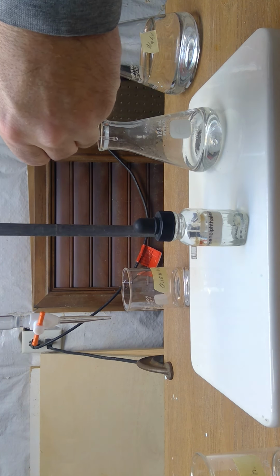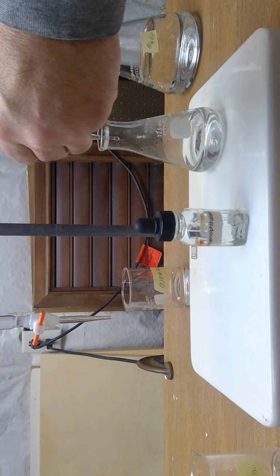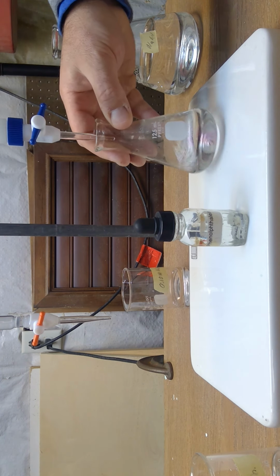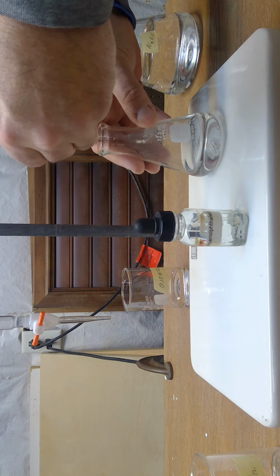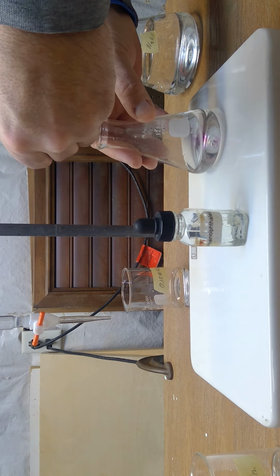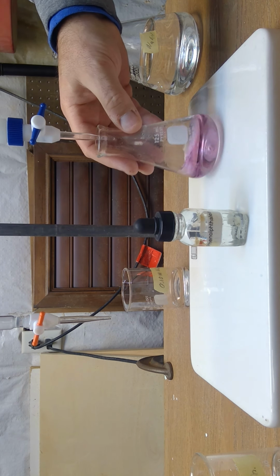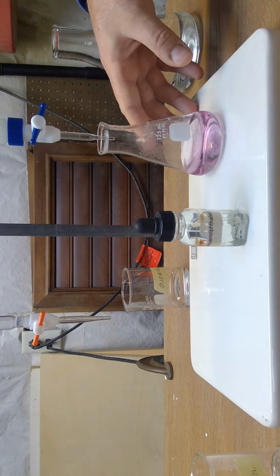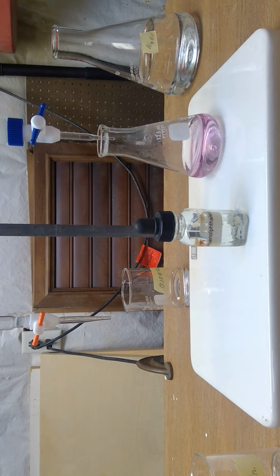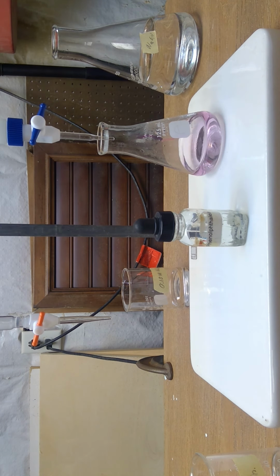All right, we're going to add one more drop. That still went away. Oh, that's going to be too much. Oh, maybe not. Oh, that's not bad. Yeah, that was not great technique, but that's the color that we want. That nice light color pink. So actually, that worked out all right.